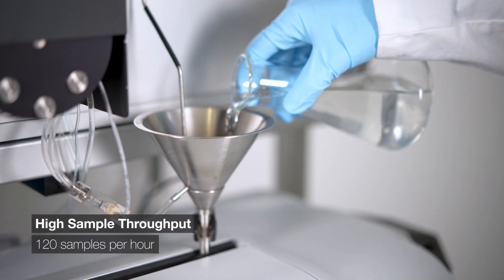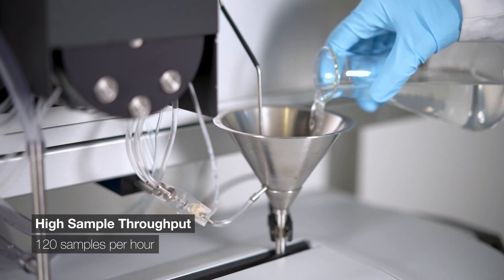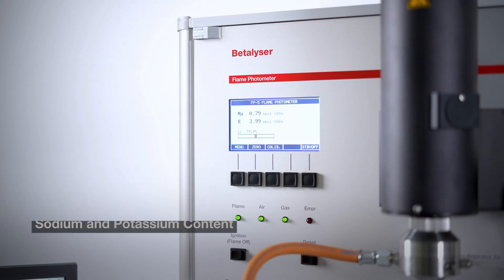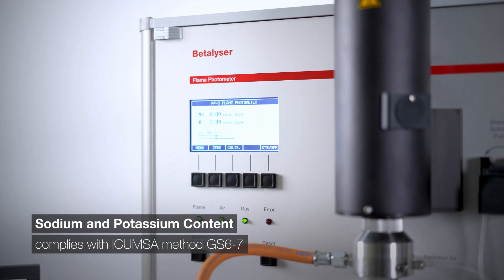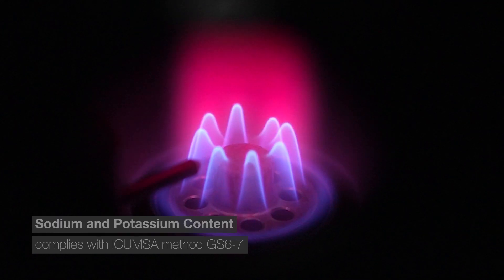Only 30 seconds per sample. Thousands of samples a day. Operable as a standalone system or integrable into an automated beet reception.